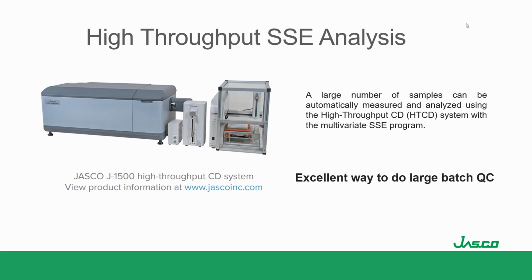And not only is the sample measurement automated here, we're also going to automate the analysis as well. So we're not going to have to go through and do a lot of number crunching before we can get our secondary structure estimations.